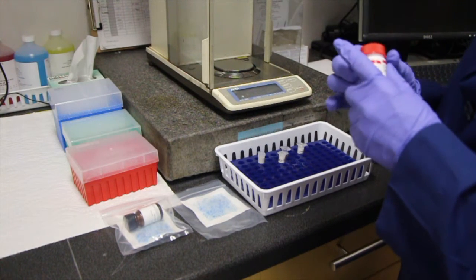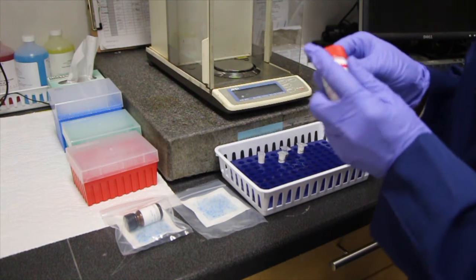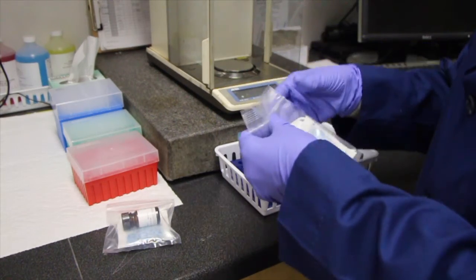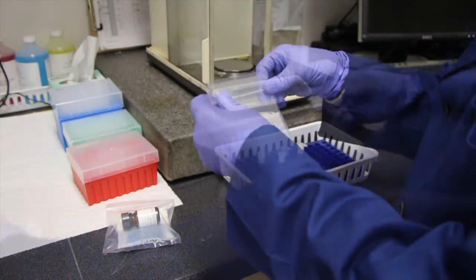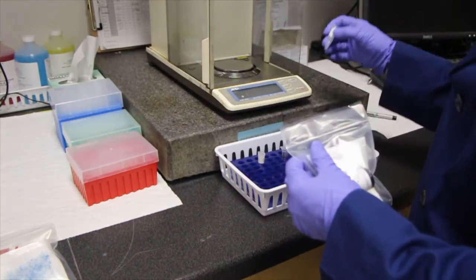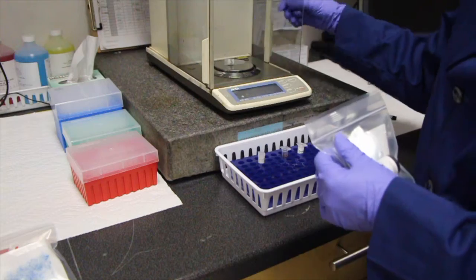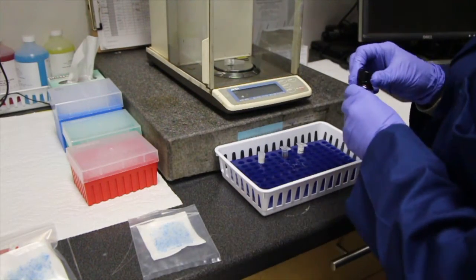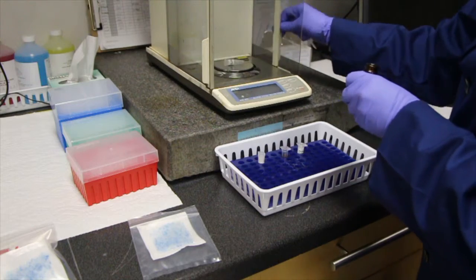When putting the reagents back for storage, wrap them with parafilm to lessen their exposure to air. Store them in a sealed package with desiccant. Repeat the process for the sulfo-NHS, tarring the vial on the balance, removing the bottle from storage, and weighing out between 2 and 10 milligrams.